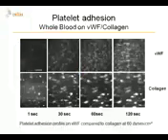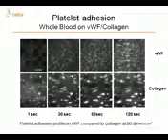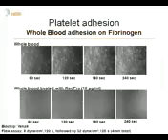We also compared different pathways of platelet recruitment to both von Willebrand factor and collagen. As you can see, we perfused the whole blood on collagen and on von Willebrand factor at 60 dynes per square centimeter. This is a 2-minute time lapse. So as you can see, on von Willebrand factor you mainly have single platelets or small aggregates, and on collagen you have big aggregates but a very small number of these aggregates.